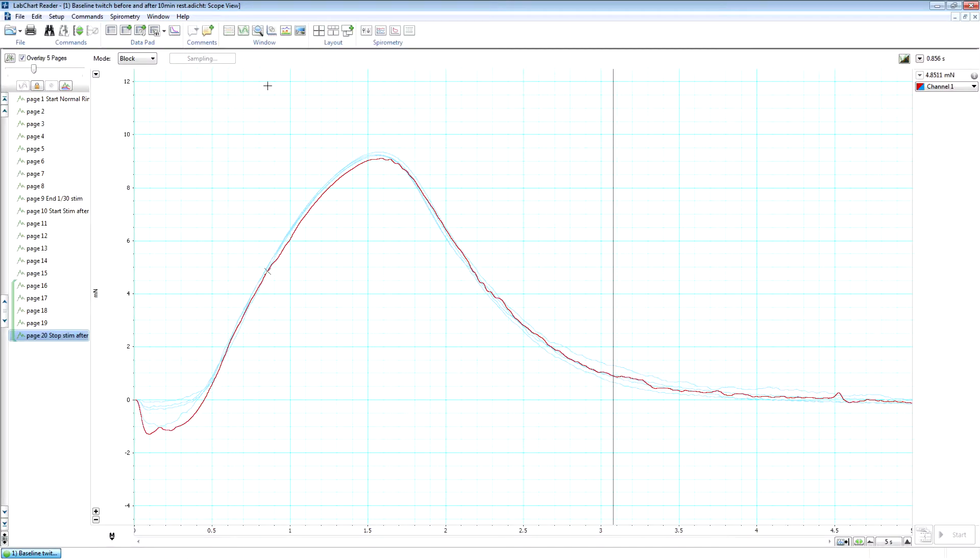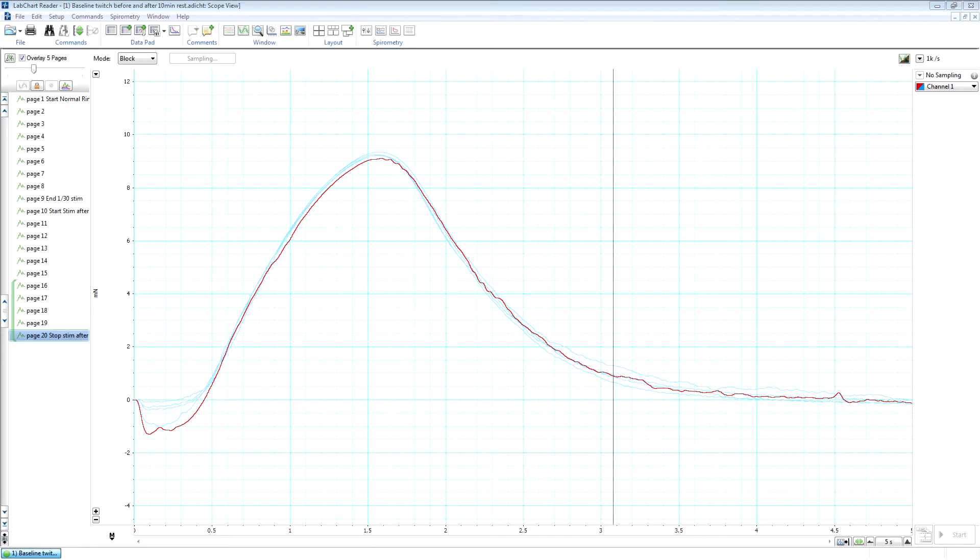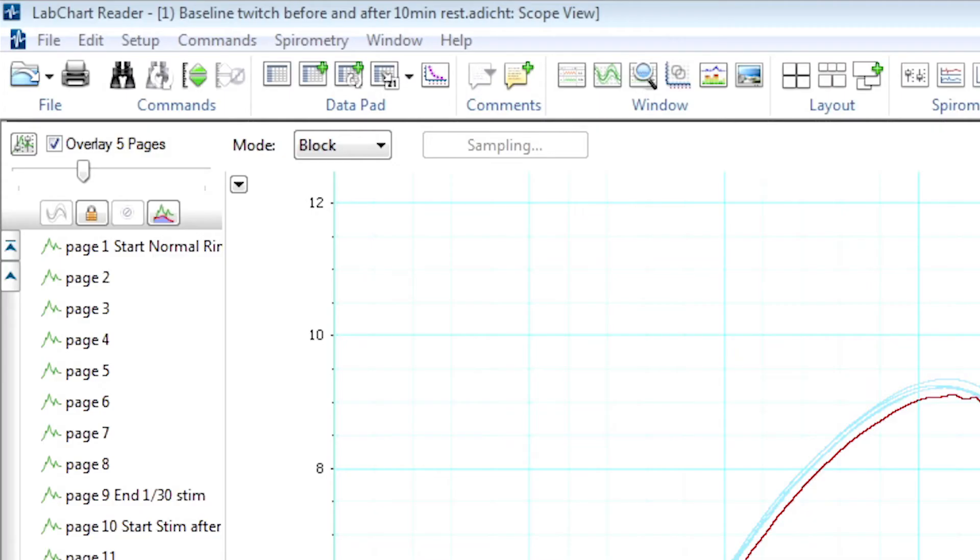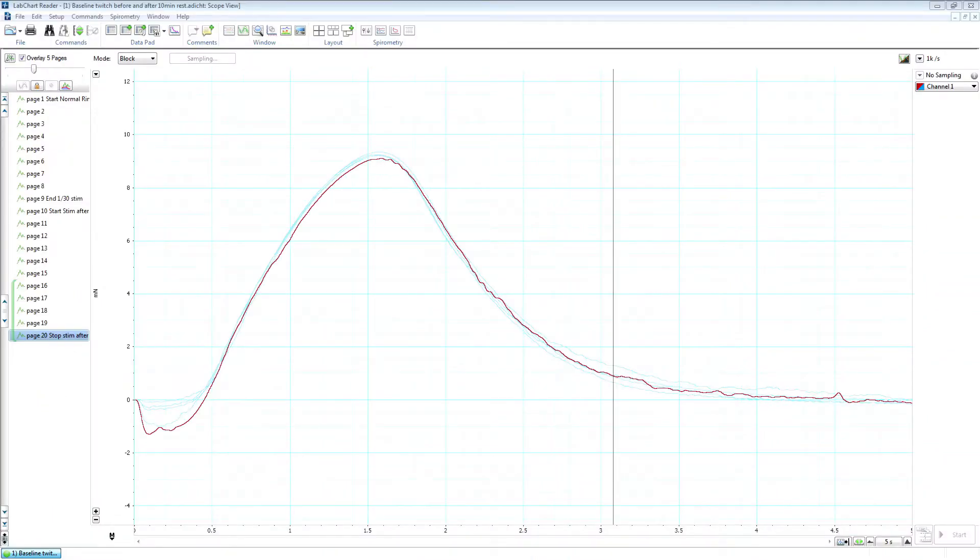All right. So now we'll have a look at how to change the information that's being displayed on the screen. So when you're looking at the data, the trace from the highlighted page shown over here in the left hand column is shown in red. And so that's the active page. When the overlay box at the top of that menu is checked, then we'll display the number of pages that we've got selected using that slider. And so here we've got five pages selected, and so we're displaying five pages, including the active page.